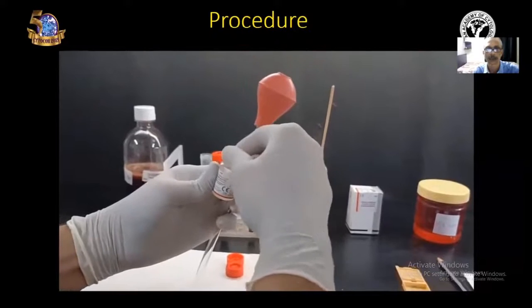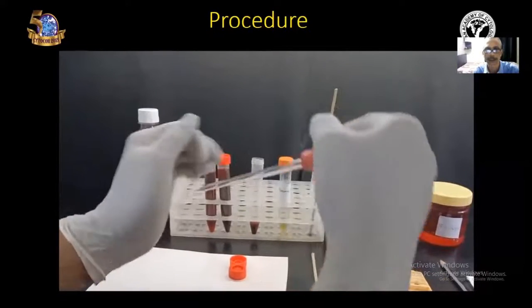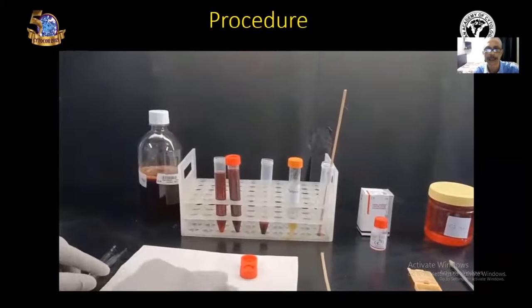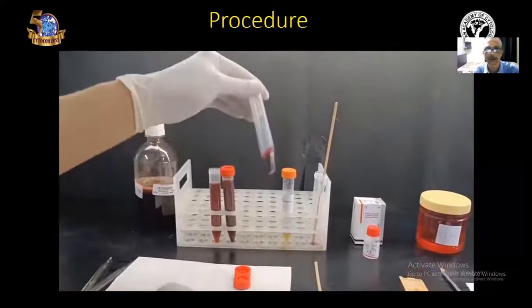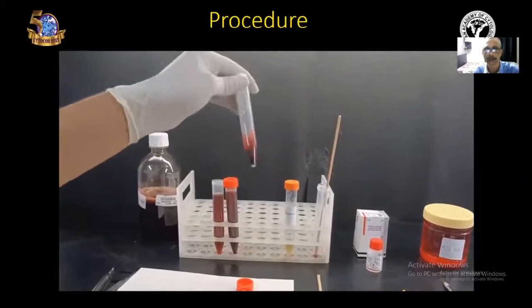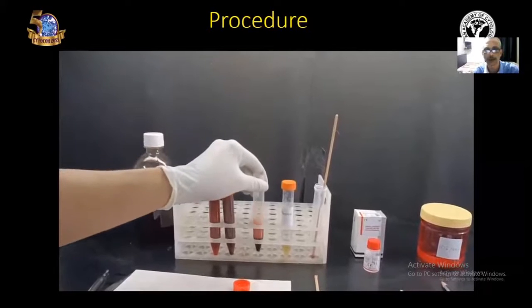Keep the thromboplastin aside and Pasteur pipette aside, and mix the sediment with the plasma and thromboplastin and keep the tube for five minutes.